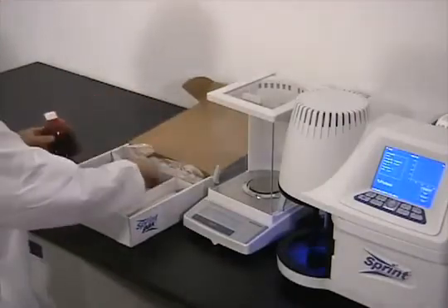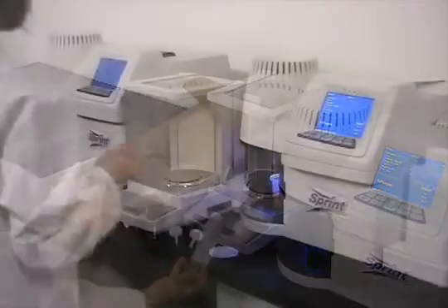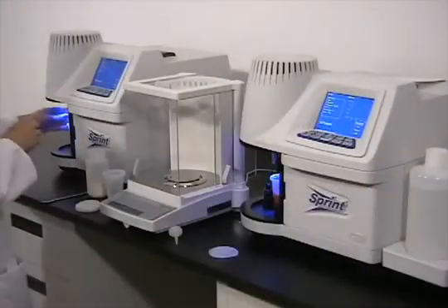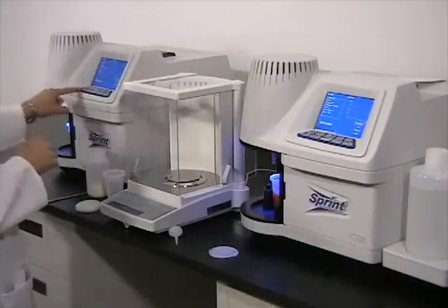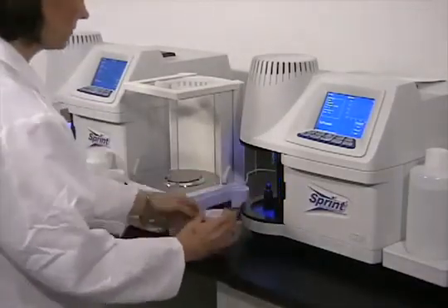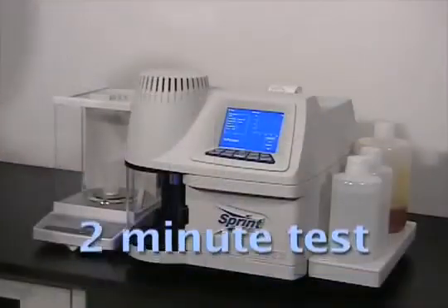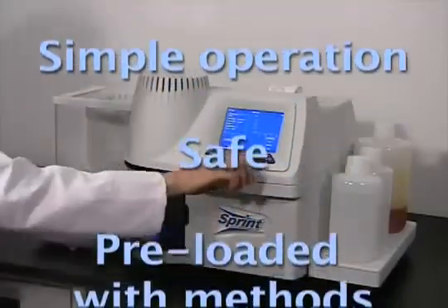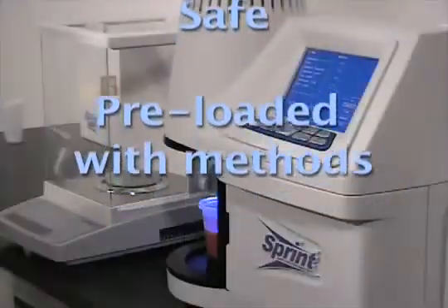Sprint packs contain everything you need to analyze 50 samples. If you have a large number of samples to analyze, you can simply add another Sprint to your laboratory and prepare samples with a single balance. The CEM Sprint is fast — most samples can be analyzed in about 2 minutes. It is simple to operate, uses safe, non-toxic ITAG and operates at room temperature.